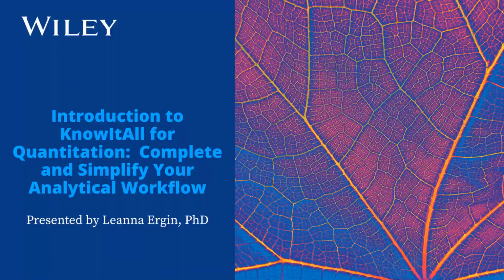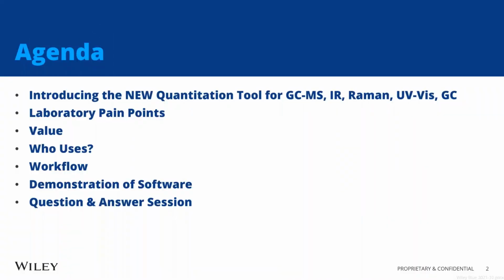Thank you, Mark. So the agenda for today is first I'll be introducing our new quantitation tool. It's useful for GCMS, IR, Raman, UV-Vis, and GC. After that, I'll be discussing the pain points that a lot of different laboratories experience, and then the value of this software and how it can help overcome a lot of those pain points. Then I'll be talking about who would want to use this software, the workflow that the user would use to accomplish quantitation. Then I'll be giving a demonstration of the software, and at the end we should have time for a question and answer session.